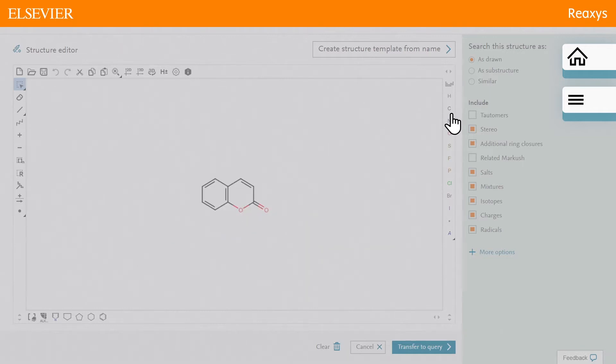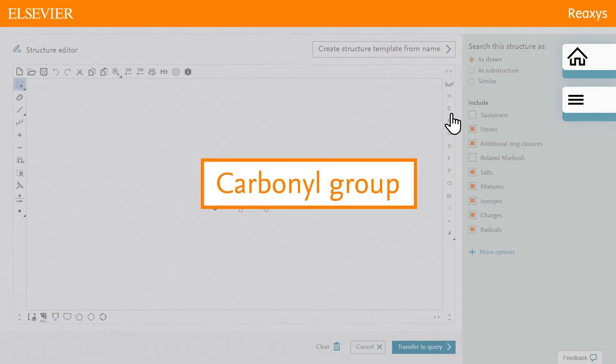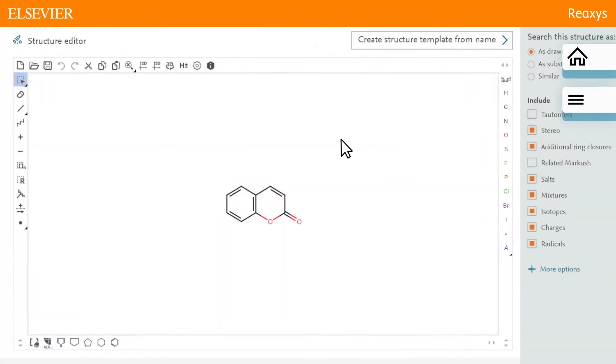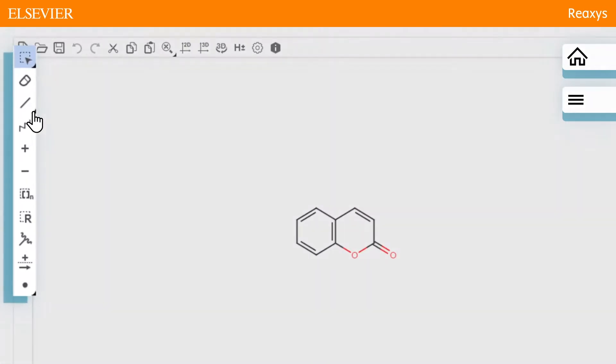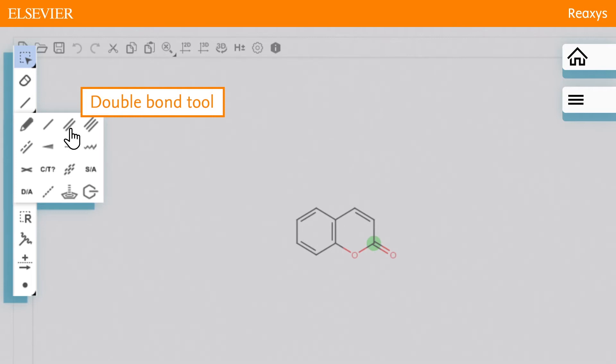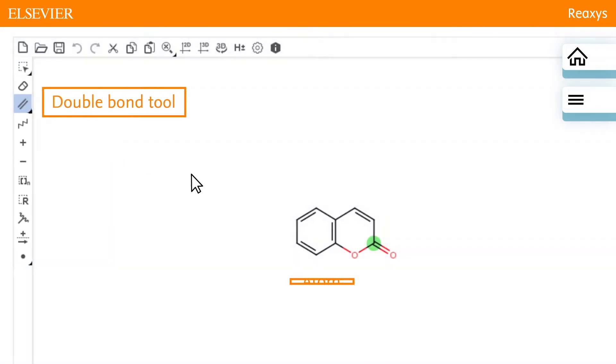We will replace the carbonyl group with a sulfonyl group. First, add a double bond off this carbon position by clicking the double bond tool and the atom.